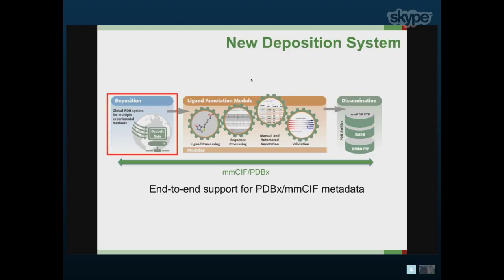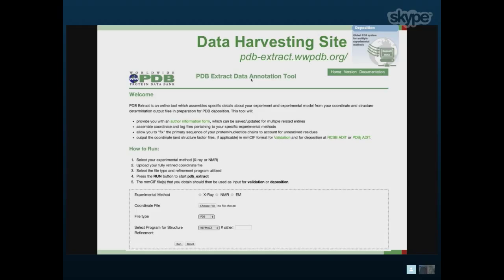Our pipeline for data collection and deposition is based on the agreed metadata framework, which is entirely instrumented across the full pipeline in MMCIF. And as Herb was discussing in his talk, much of the work of packaging information for the pipeline is done via data harvesting operations, and this is particularly the case for anything having to do with data collection. In the last year and a half, we have had the benefit of a significant amount of work on behalf of the major protein refinement packages in delivering native MMCIF data files coming out of refinement to the deposition system.